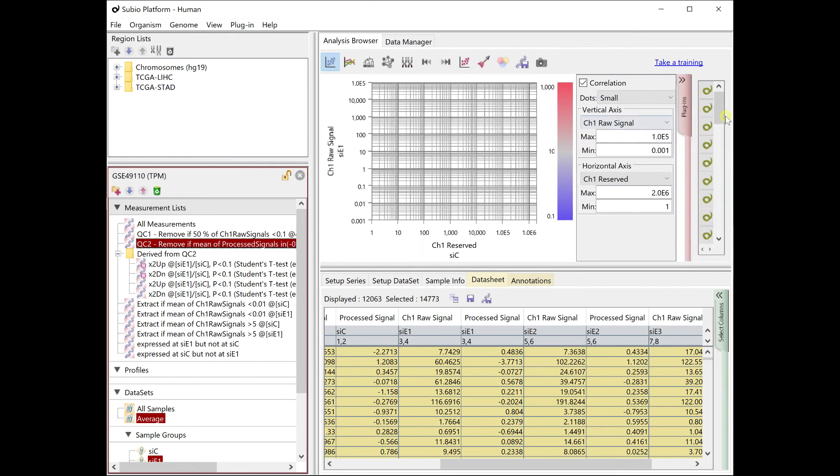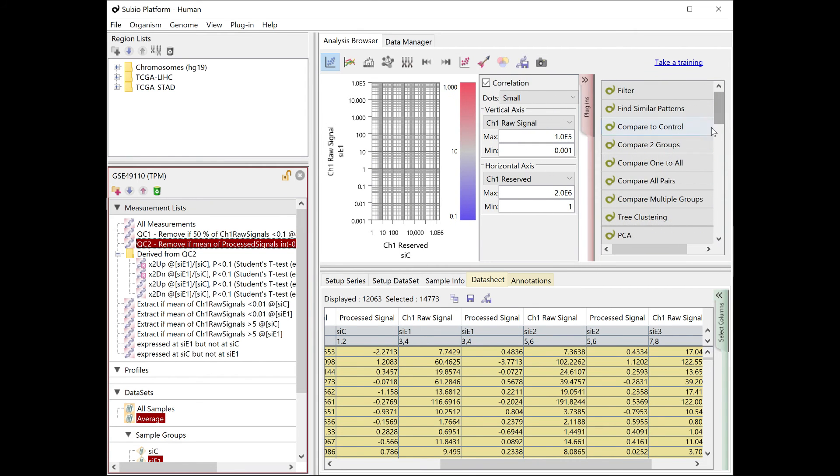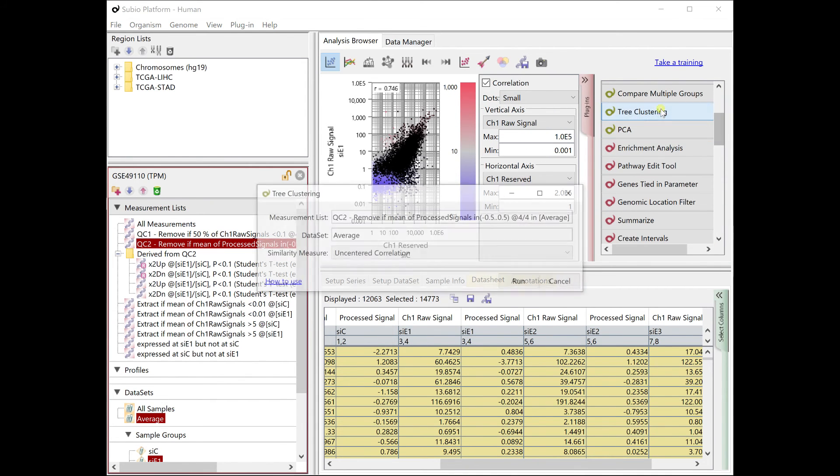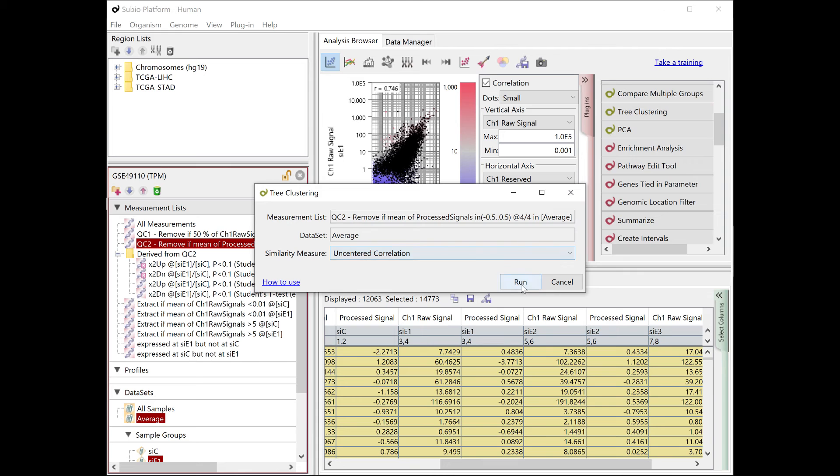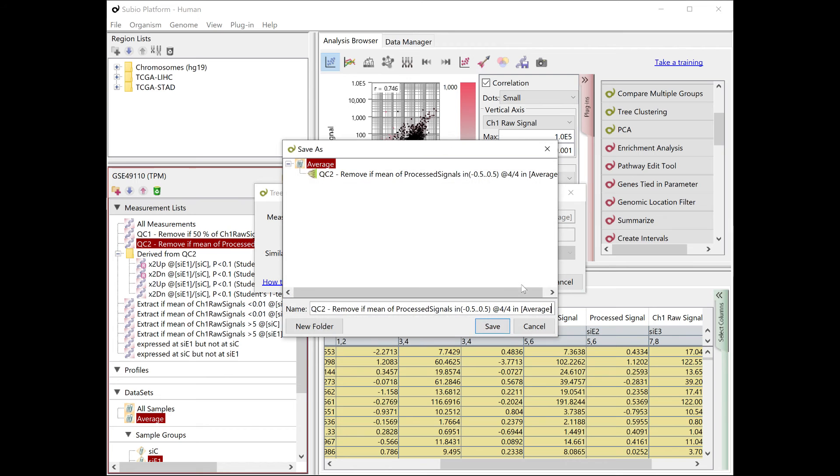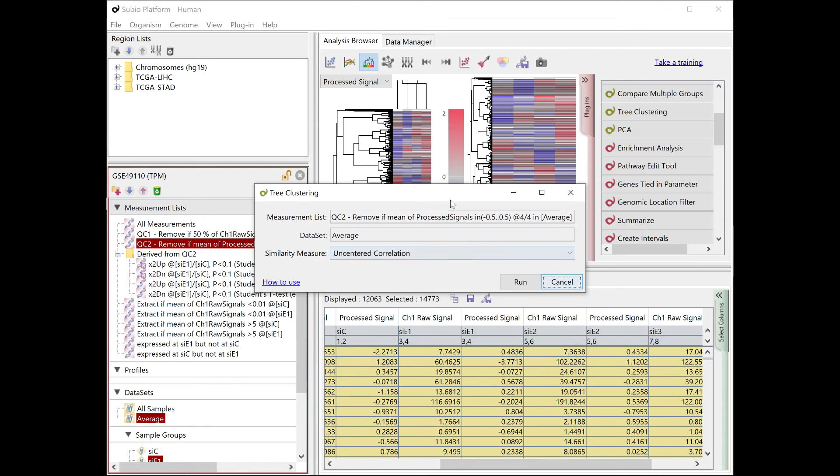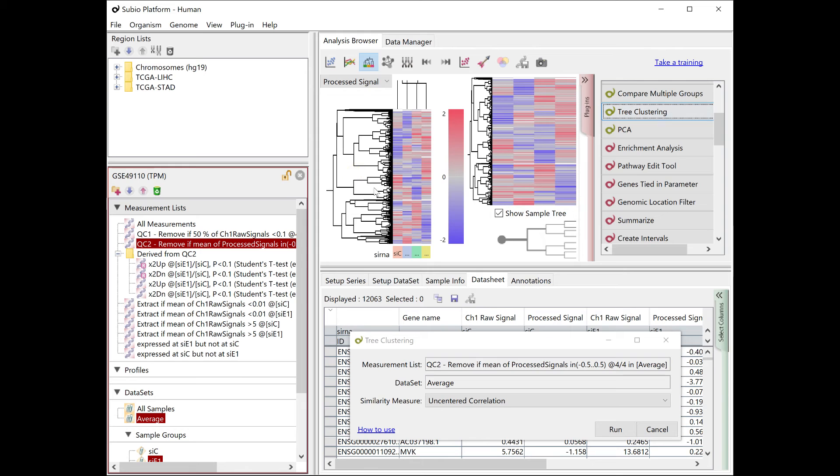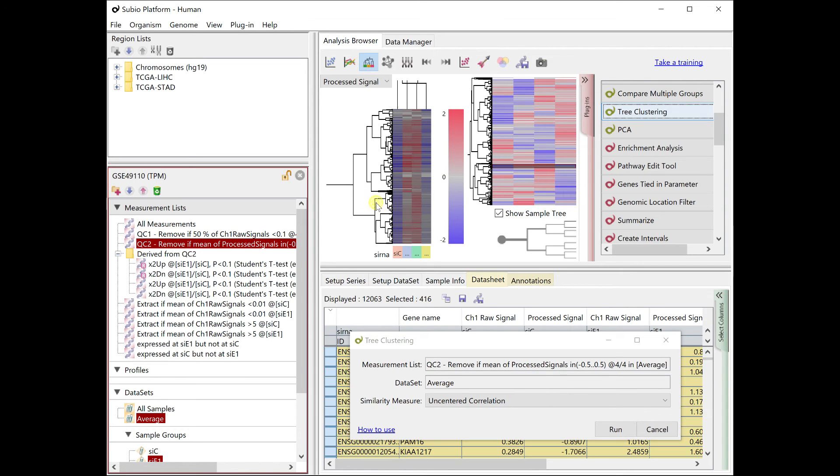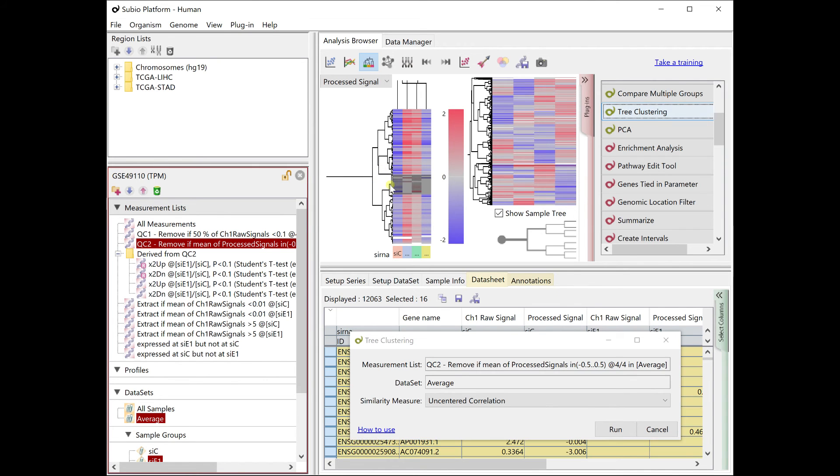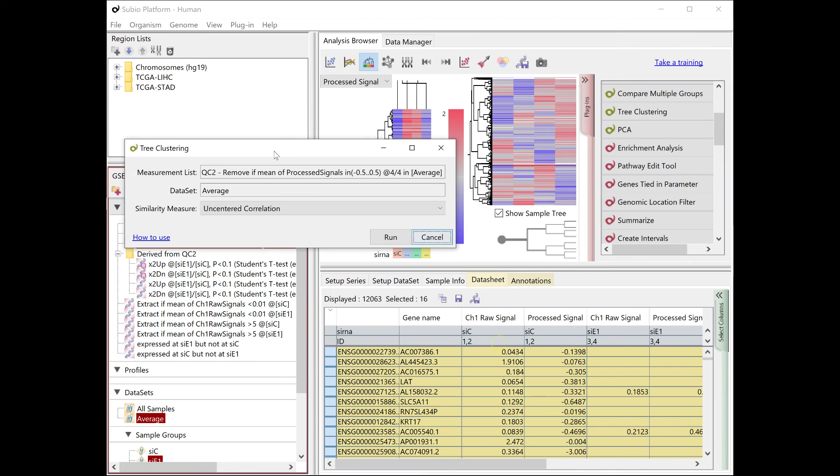By the way, if you apply clustering with the QC2 on this processed signals, you see that the resulting heat map lacks some parts. What is missing is the absence of TPM value.